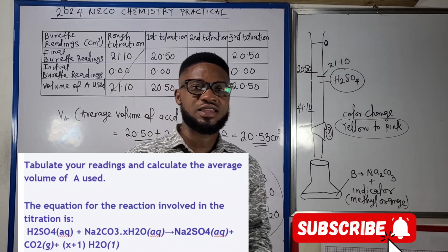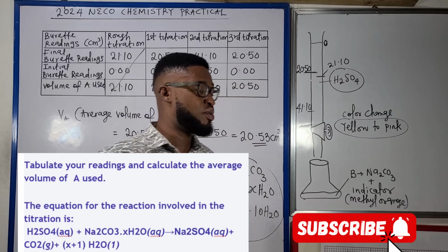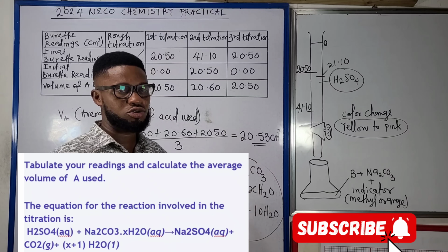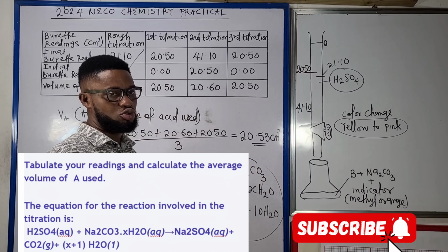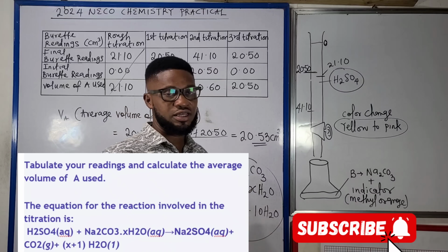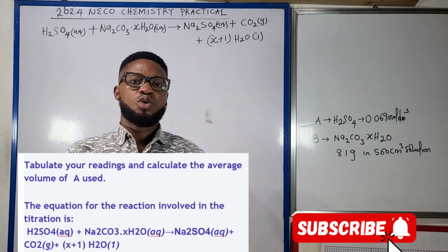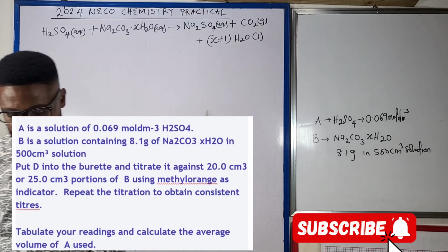At your respective center, you are to use the titer value or the endpoint of your instructor there. So this is just going to be a guide for you to know how to go about your calculation in the course of this exam. And so what should our question exactly look like? Now look at this question prototype.